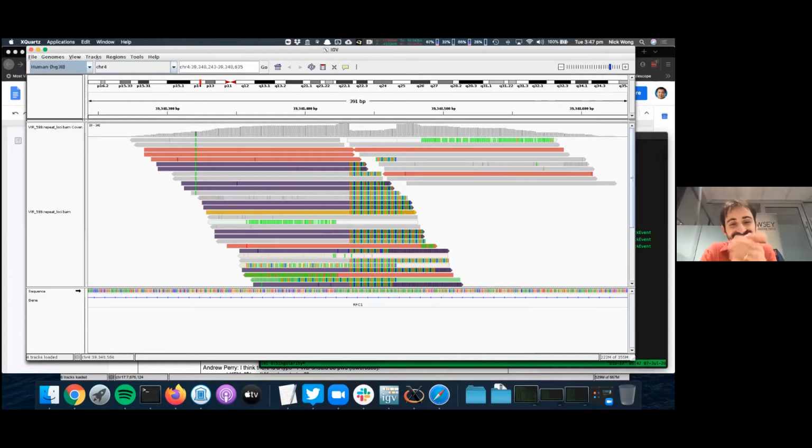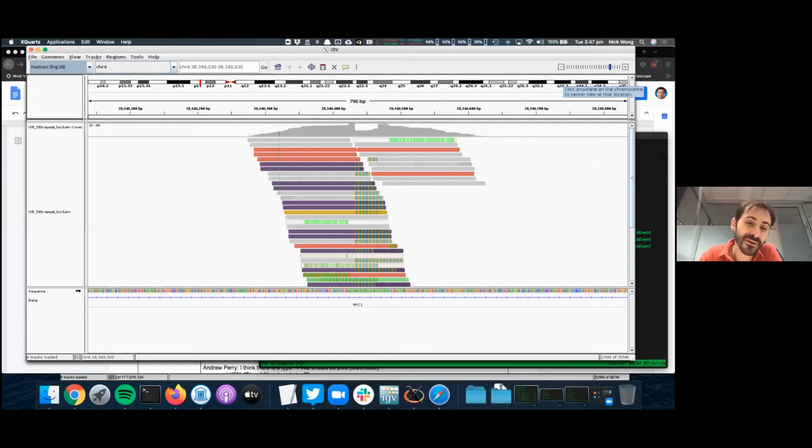Thanks, Sarah. So we got to see something cool from a genome today with IGV, and the most important thing, we did that in a container, so we didn't have to install the application ourselves.